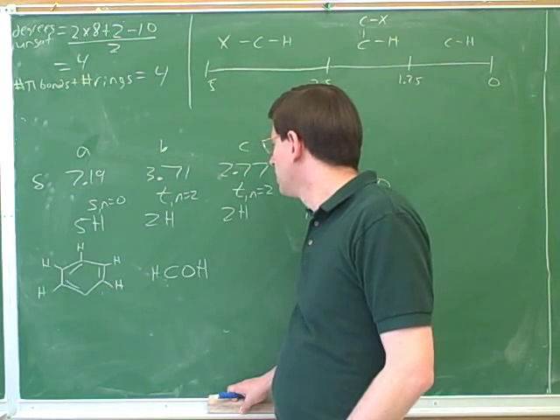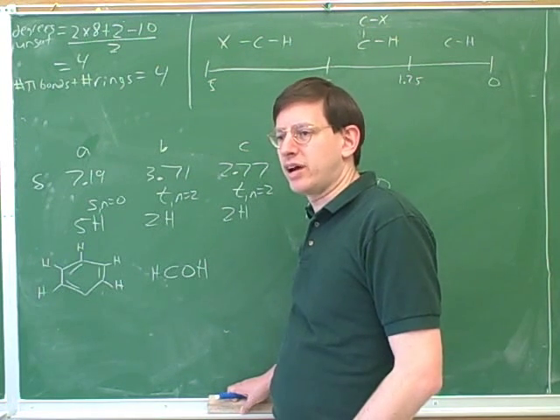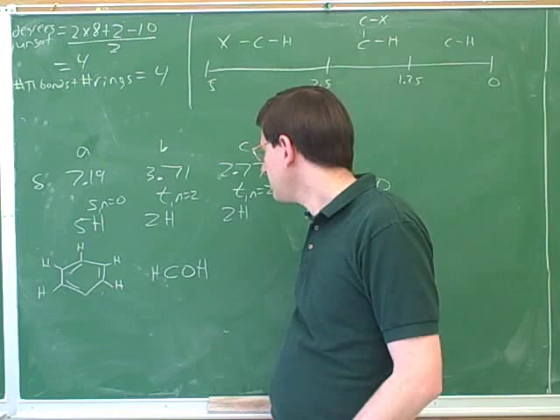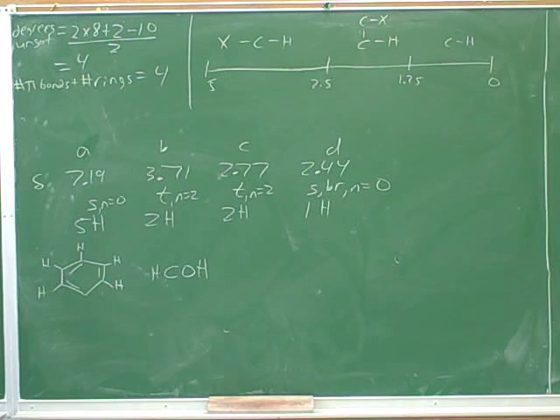Now, let's see. First of all, remember that alcohols don't do splitting. Remember we talked earlier that alcohol hydrogens don't do splitting, so this can't be the alcohol hydrogens because these are split. Alcohol hydrogens don't split other hydrogens, and they don't get split themselves. Alcohol hydrogens in normal situations are always singlets. That's something we saw somewhat earlier today.